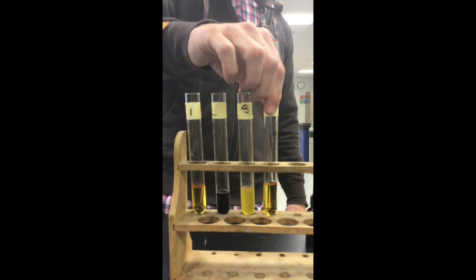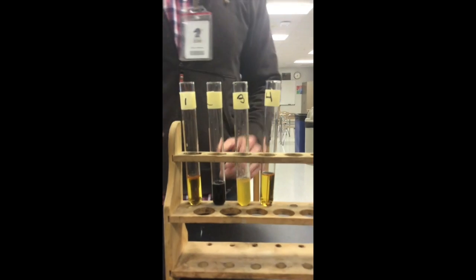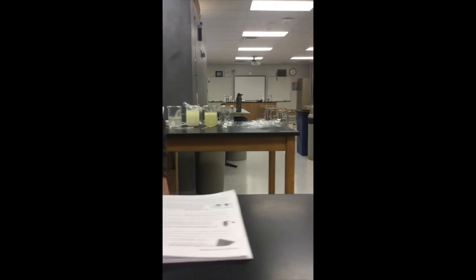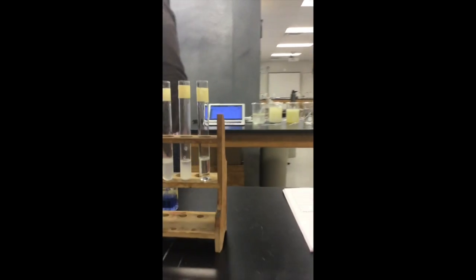So we'll let those sit for a little bit just to be sure, and we'll come back before we record our data. All right, let's go to test number 4.